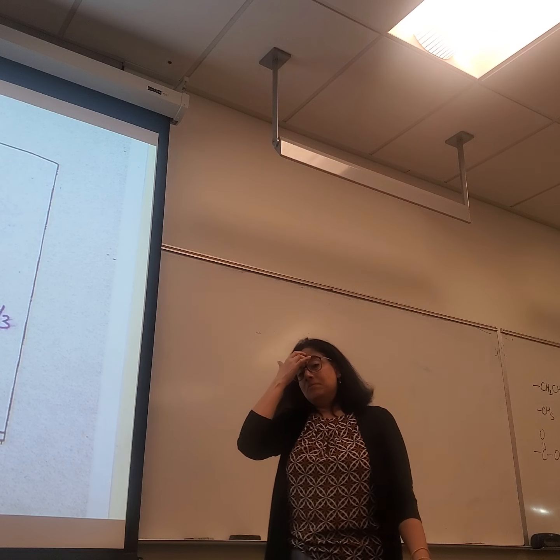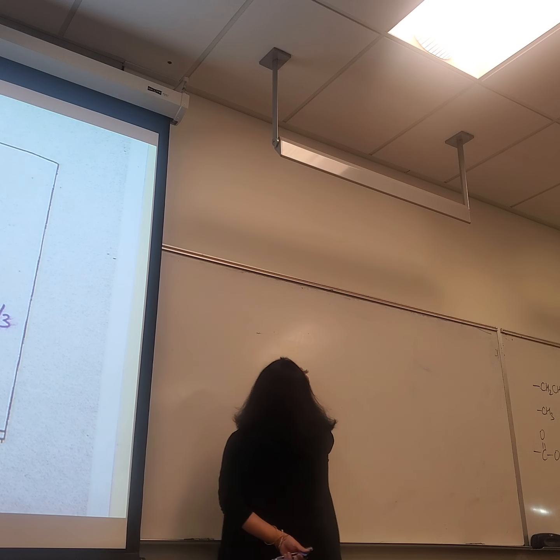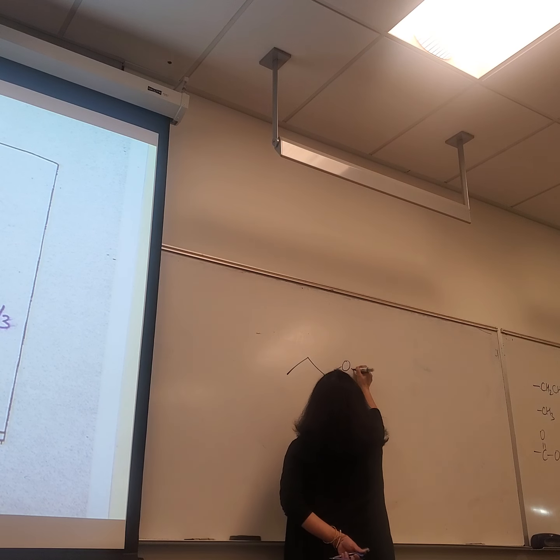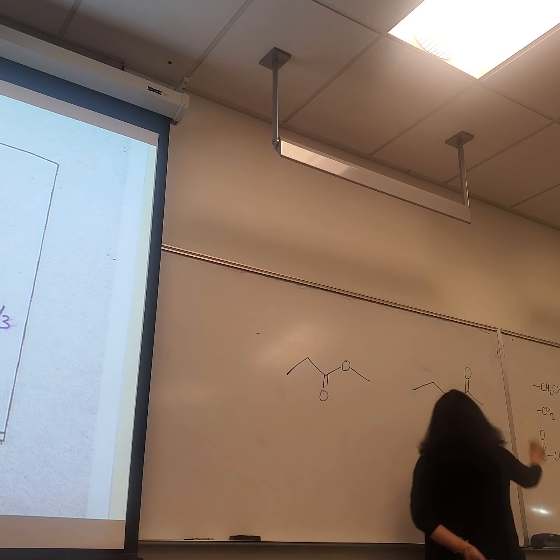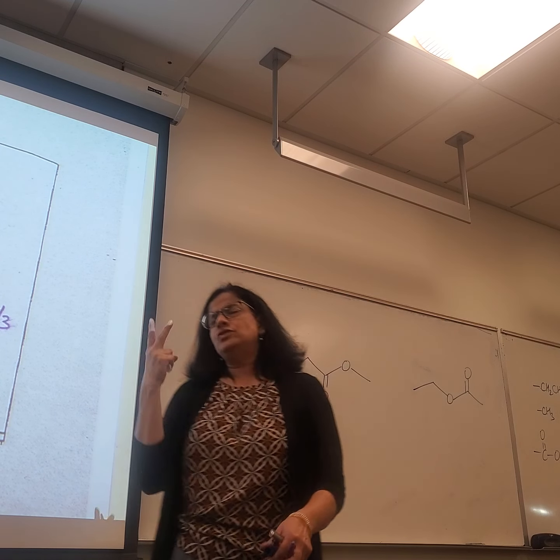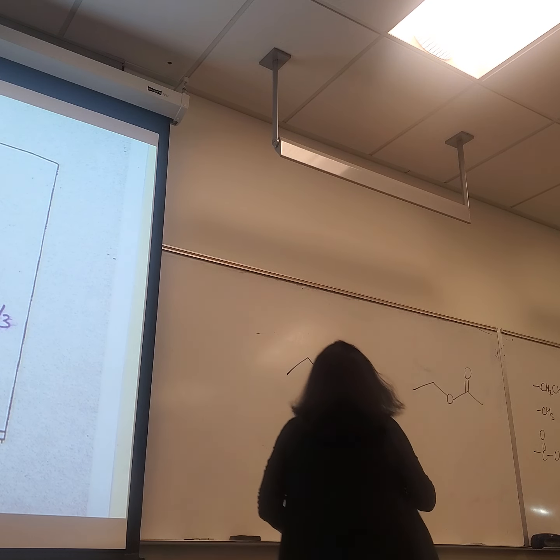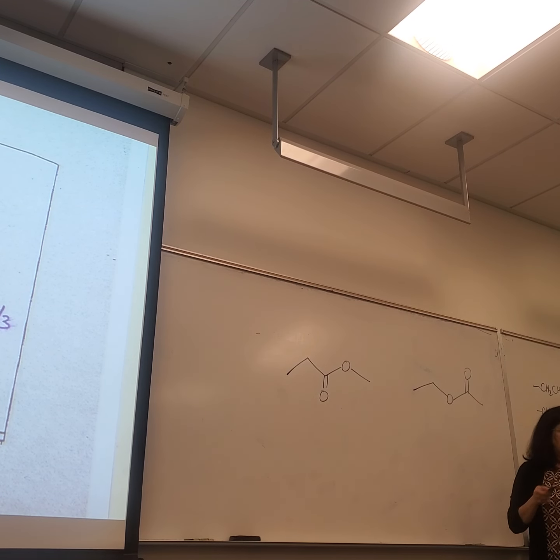2. What are those 2? H3C bonded to a carbon, double bonded to an oxygen. Agreed? Two esters, two different esters, exact same everything. So how do we decide which of those two esters is this spectrum? Can you tell me what will be different between the NMR spectra of these two compounds?